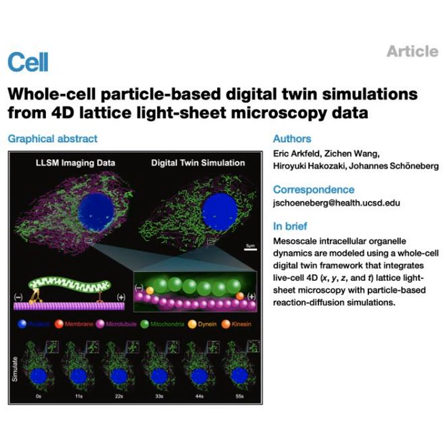To build this simulation, the researchers used Cal-27 cells. Okay, well, what are Cal-27 cells? They're an oral squamous carcinoma cell line. And what they did was stain the mitochondria with a fluorescent dye called MitoTracker Green. Then they stained the microtubules, which are basically the long structural highways of the cell, with Tubulin Tracker Deep Red. Okay, so we have our visual canvas. We've got glowing green powerhouses moving along magenta highways.